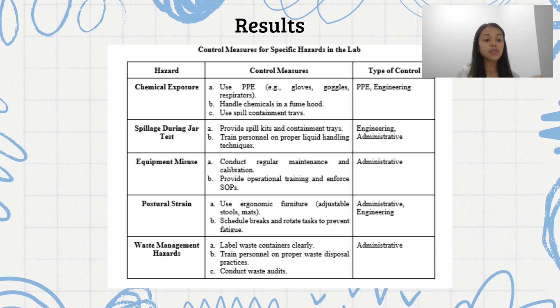And then the next one is administrative controls, modifying rules, processes, or work practices, for instance, putting standard operating procedures or SOPs into practice or offering training. The last one is wearing safety clothing to lessen exposure to risk, known as personal protective equipment or PPE, for instance, donning respirators, lab coats, gloves, and goggles.